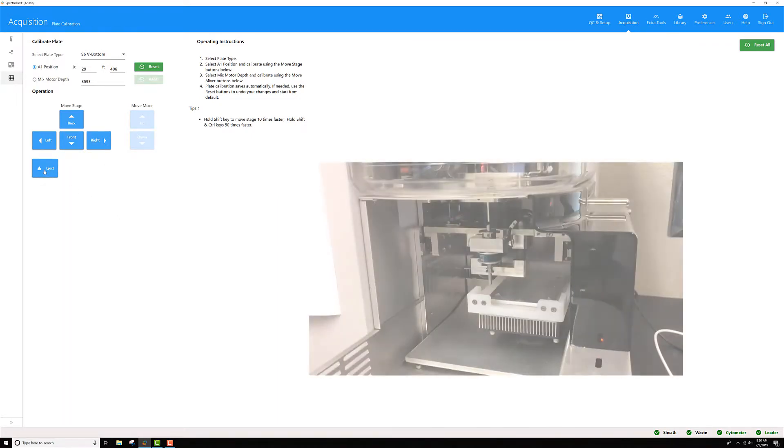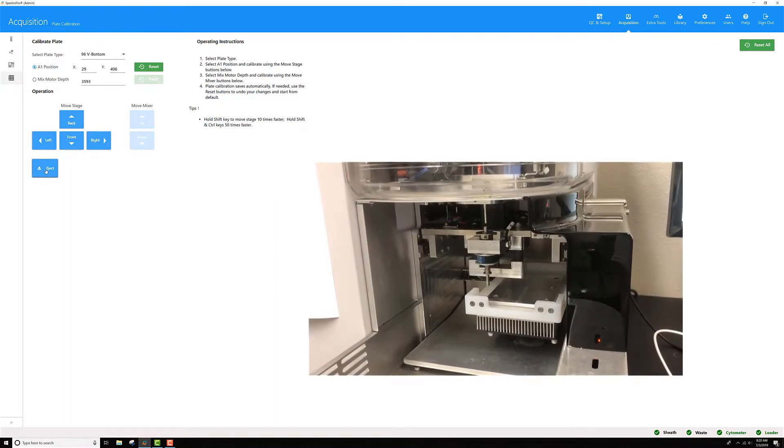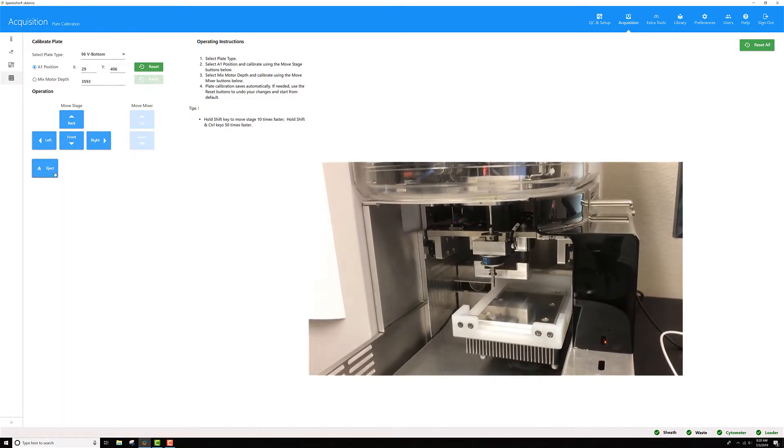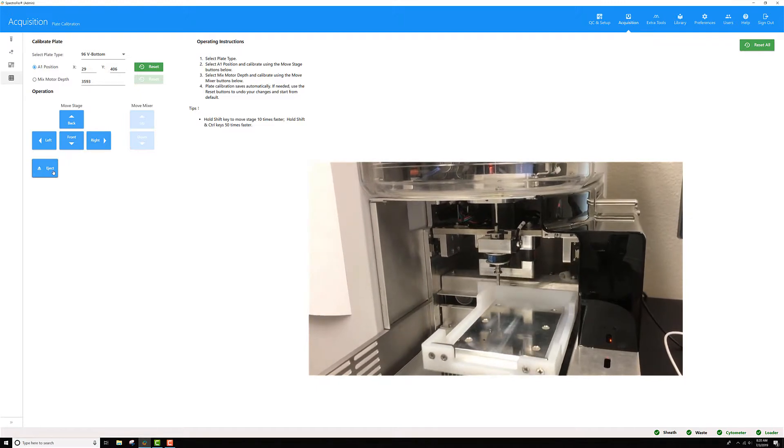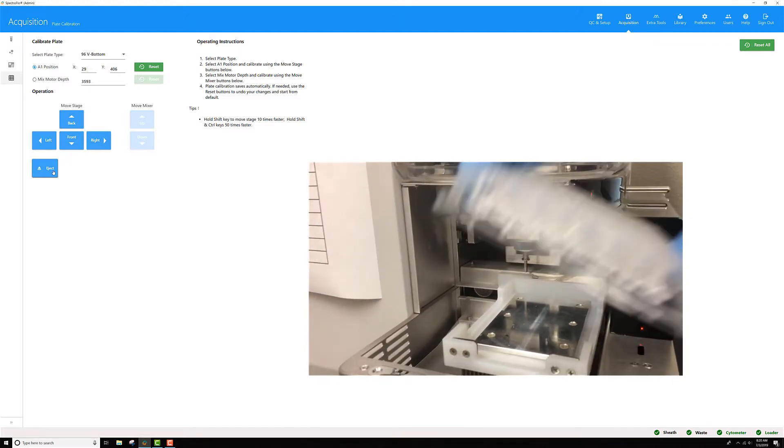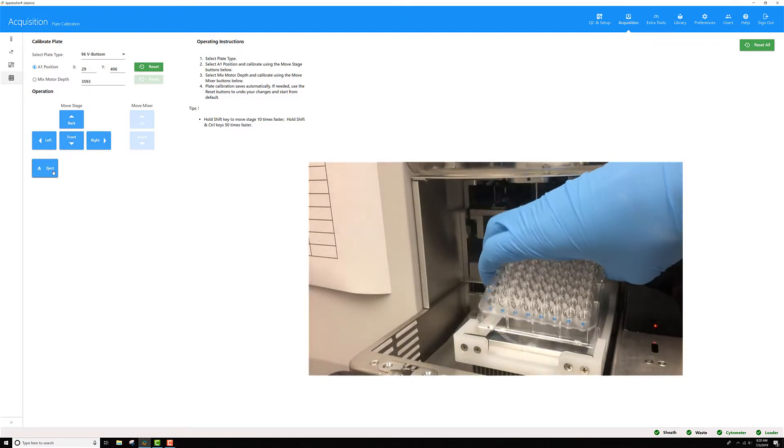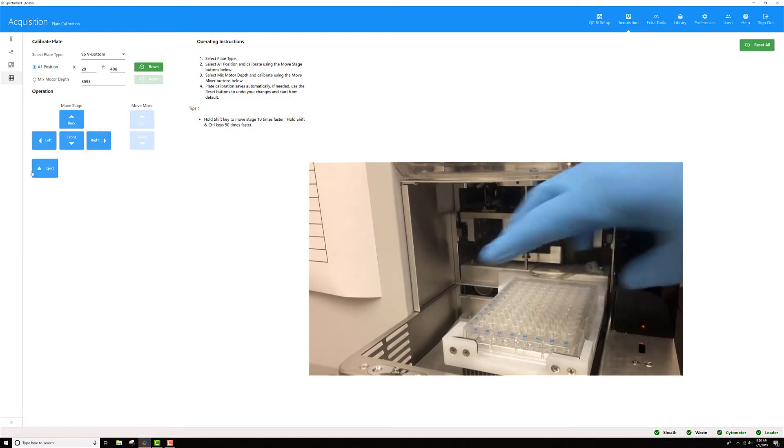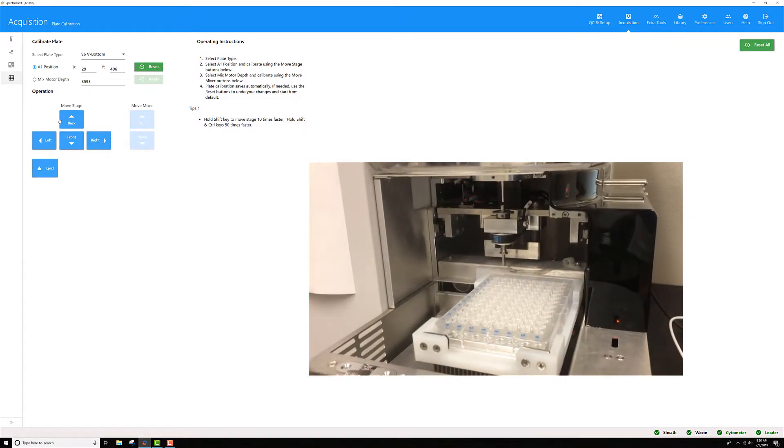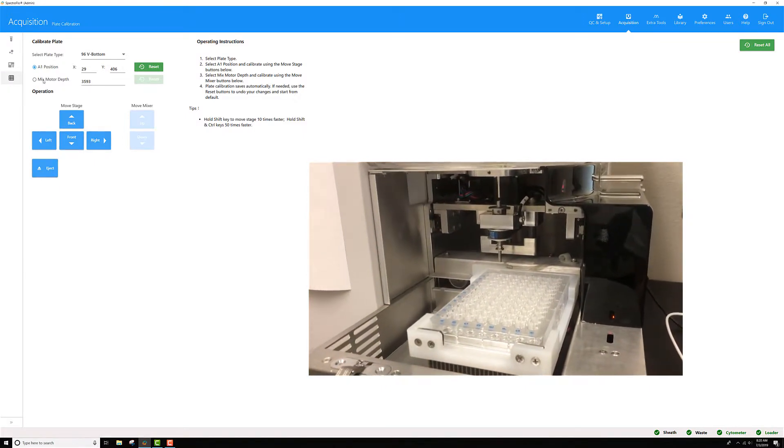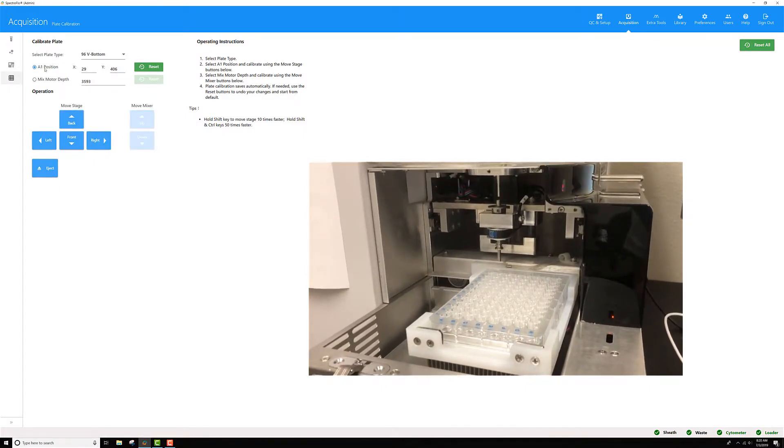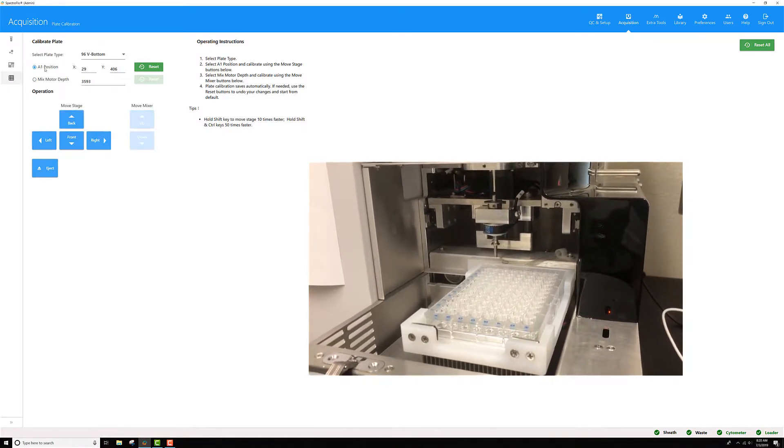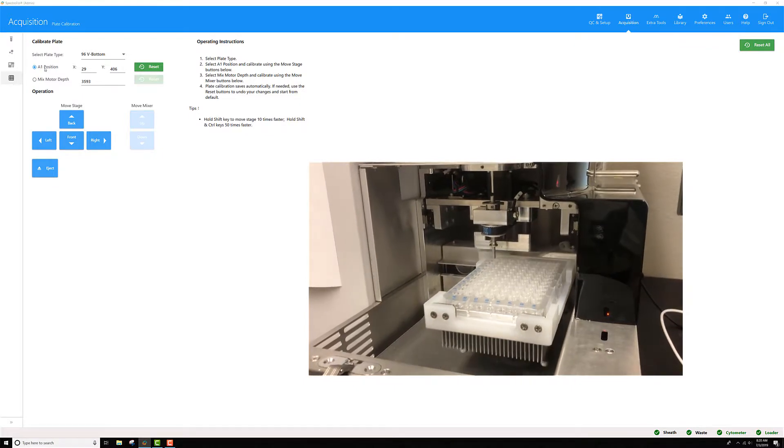At this point, I'm going to eject my plate. I haven't loaded it yet, and I will place it on my loader. Once I'm there, I'm going to toggle back and forth to get it to go to A1 again.